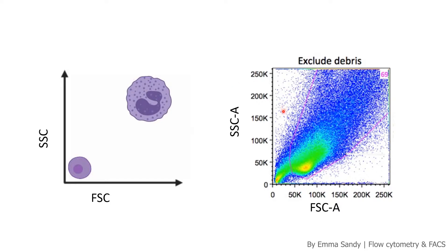This data quickly gets overcrowded, so we add extra colours to make it slightly more clear. Up here you can see the really granular and large cells, and down here you can see small pieces of debris. Somewhere in the middle we've got all the cell populations. We're interested in the cells and not the debris, so we select them — and this is called gating. We only take these cells forward and look for the next thing, which excludes all the debris.